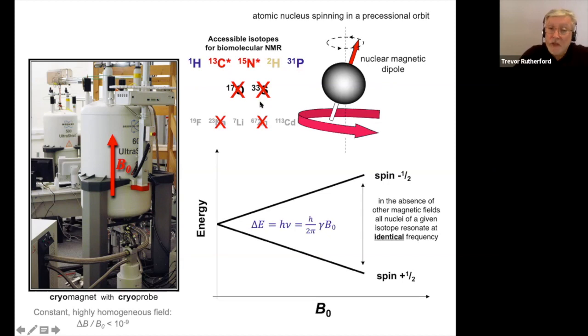And a lot of the ions that you come across, for example, zinc, there isn't a convenient NMR active nucleus. And so we can use surrogates. So directly below zinc in the periodic table is cadmium, and cadmium can be used as a surrogate of zinc binding to give us an NMR friendly and NMR active form of a metal that coordinates in pretty much the same way that zinc does.